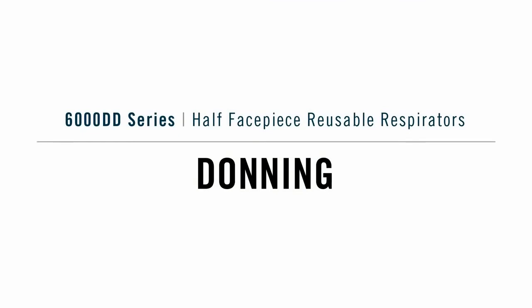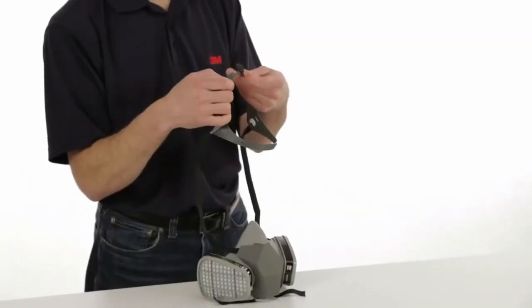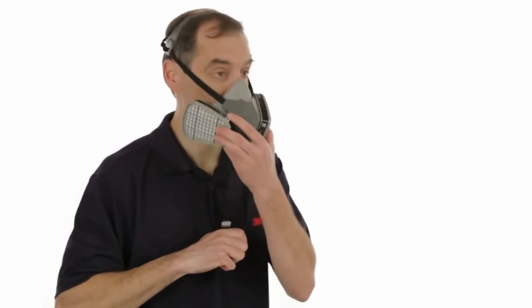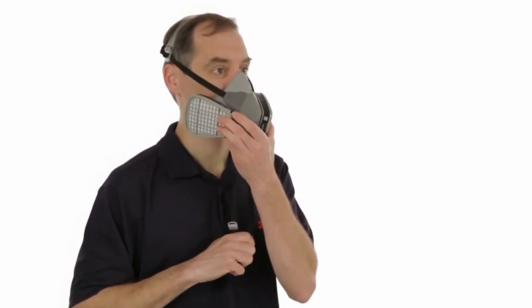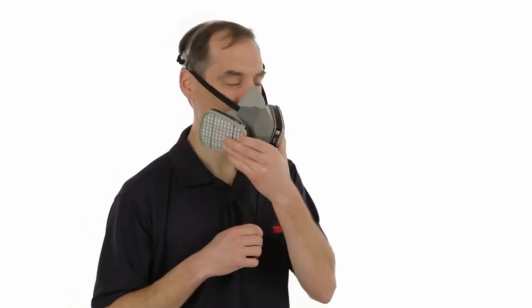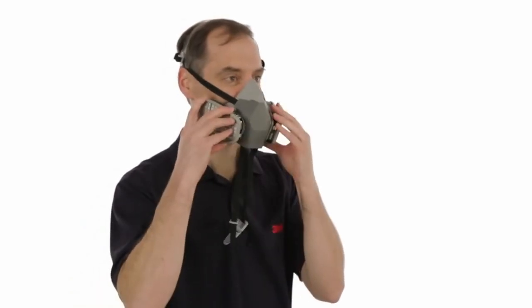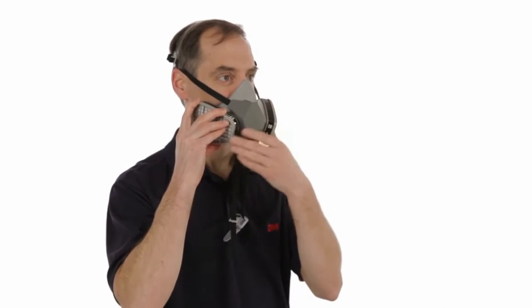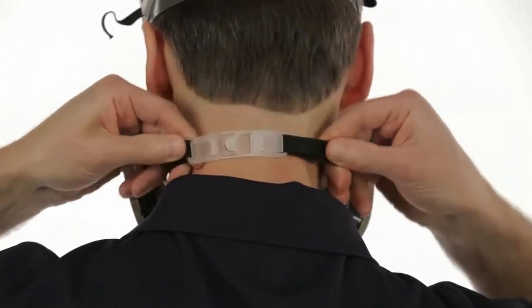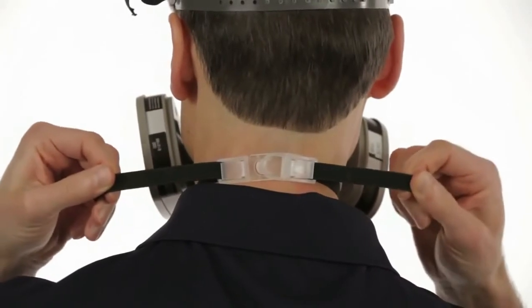Donning 6000 DD. Before you put on your respirator, adjust the head cradle size to comfortably fit your head. With the head cradle positioned on the crown of your head, hold the strap ends with one hand and slide the facepiece up onto your face with the other hand. Position the facepiece low on the bridge of your nose for the best possible fit and to prevent the respirator from blocking your vision. Take the bottom straps in both hands and hook them together behind your neck.